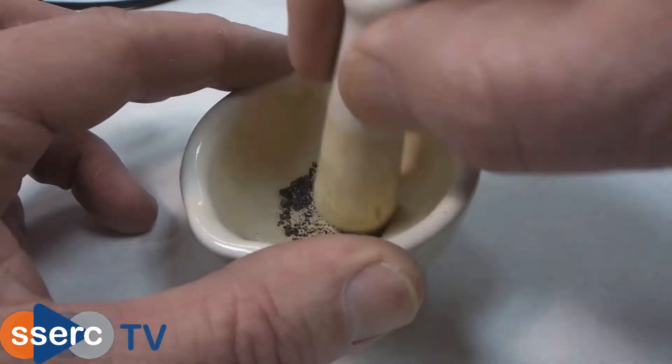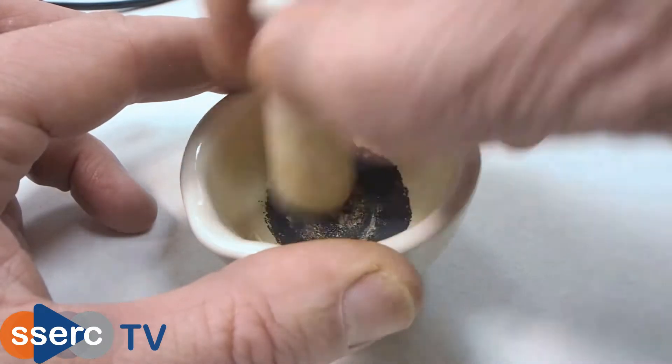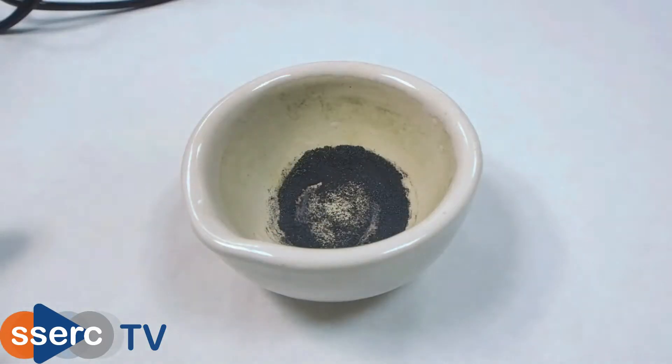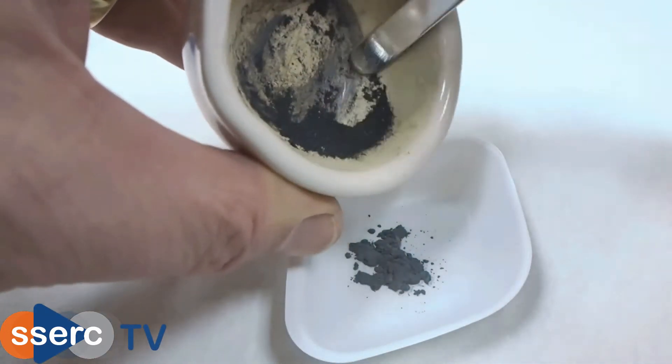Hi everyone. Today we're going to be looking at the reaction between aluminium and iodine. The first thing to do is to grind up a small amount of iodine — 0.4 grams. This is then thoroughly mixed with 0.1 grams of aluminium powder.